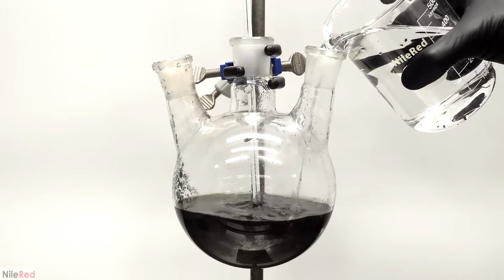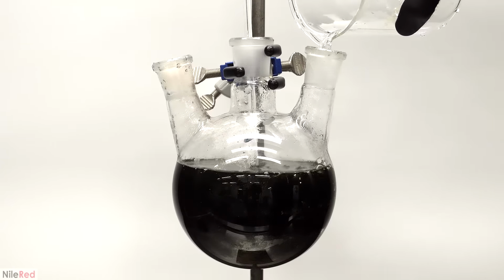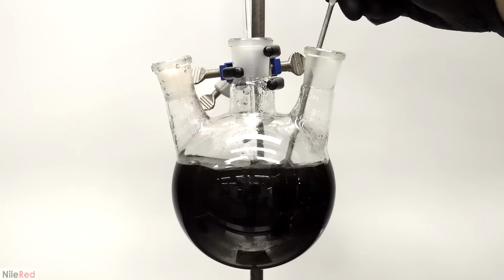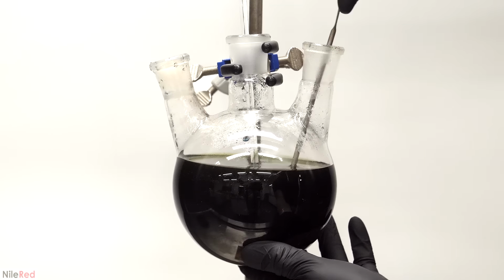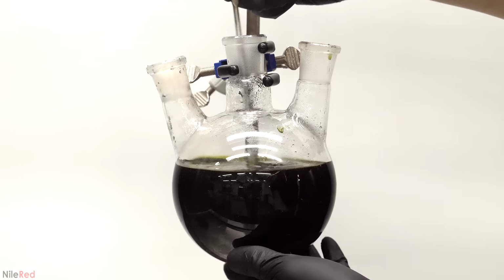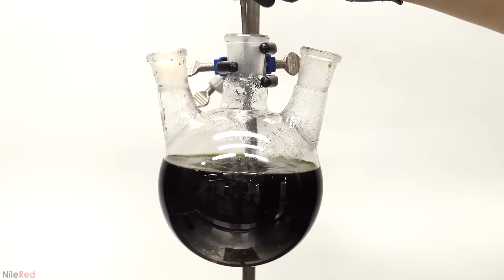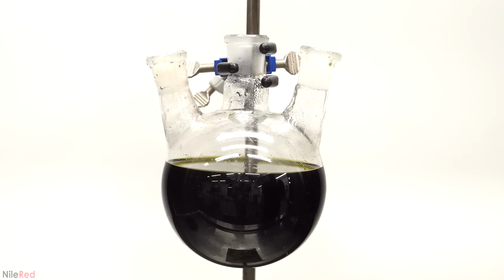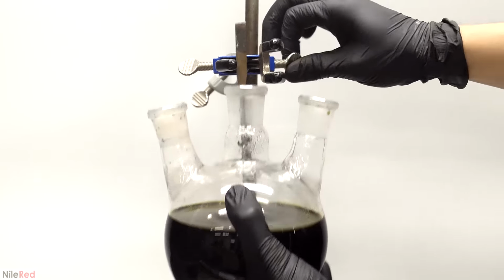Then, I poured in a bunch of hot water, and I poked around at it a bit. The stuff at the bottom had totally solidified, but it was all still soluble in water. So, all I had to do was let it sit there, and to occasionally mix it around. I also sometimes used my heat gun to warm it up, and it actually went way faster than I expected. At first, I honestly thought that it was going to take the entire day, but it ended up being done in less than half an hour.